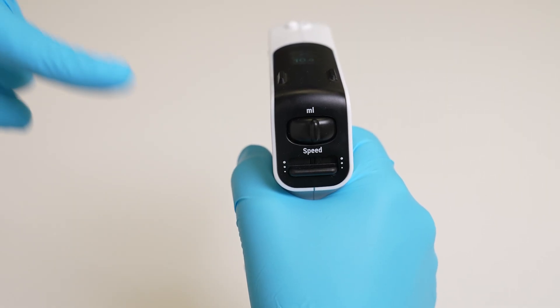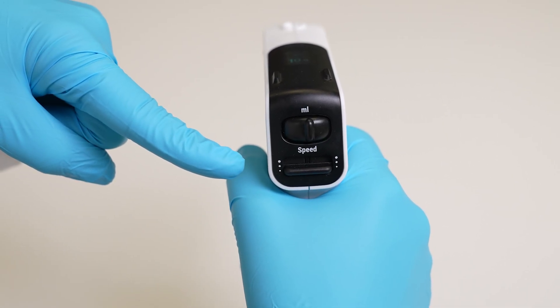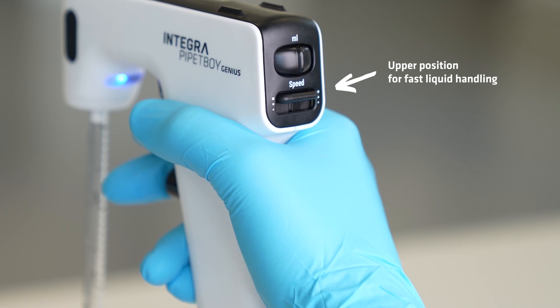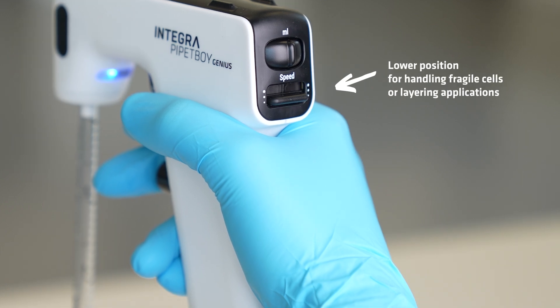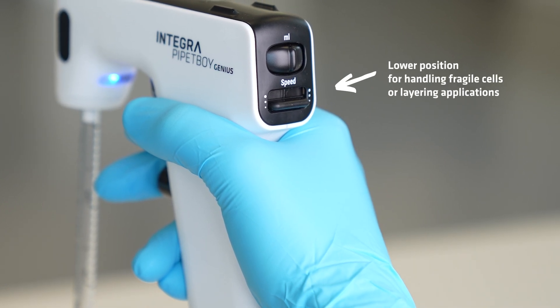Firstly, the instrument is equipped with three speed settings. Simply move the speed slider to the upper position for fast liquid handling, the middle setting for standard speed operations, or the lower position for handling fragile cells or layering applications.